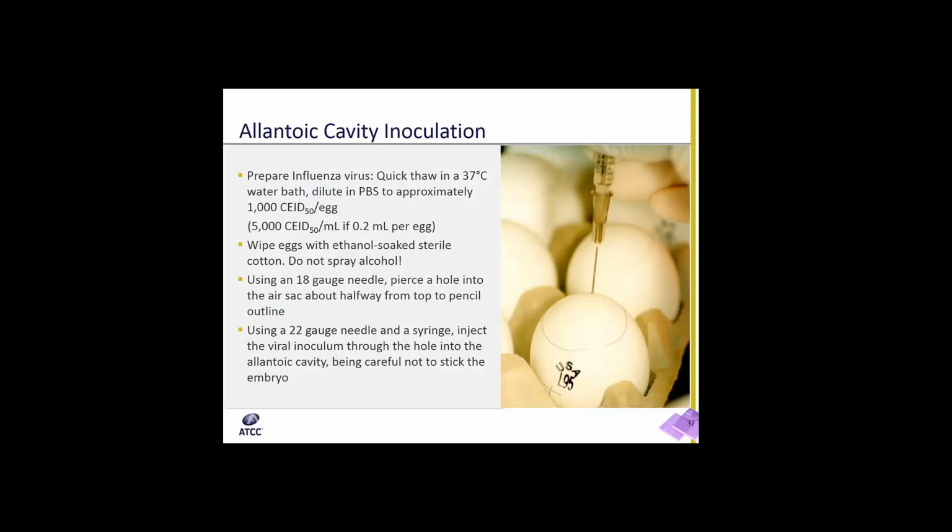You wipe the eggs with an ethanol-soaked sterile cotton. Do not spray the eggs with alcohol, as that can change the permeability of the eggs and actually allow for more infection of bacterial contaminants.